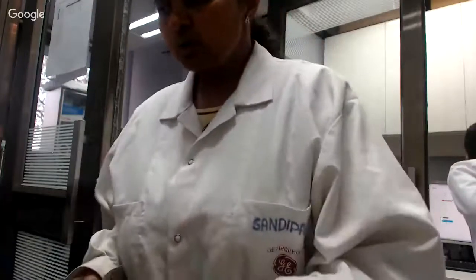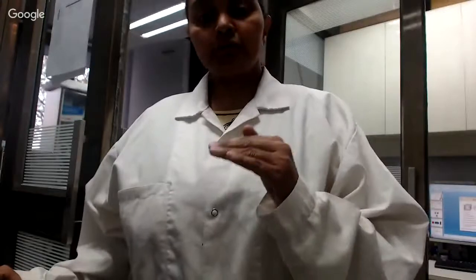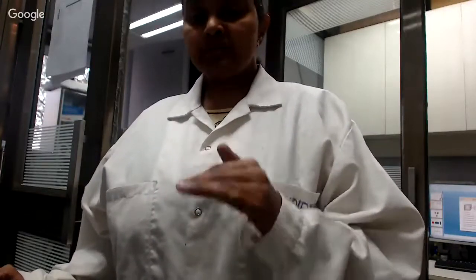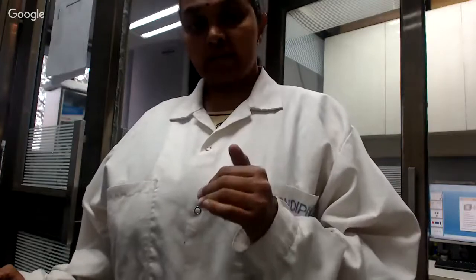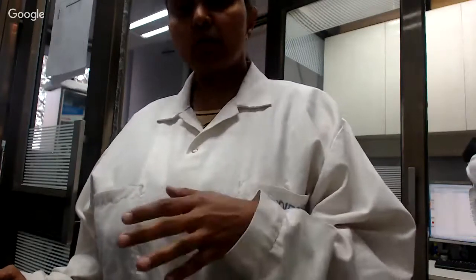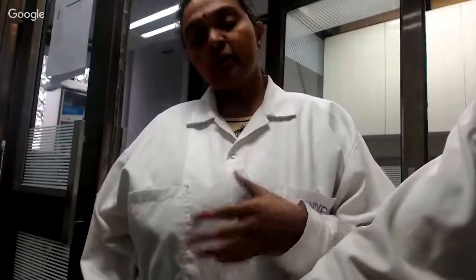There are different ways of loading samples. There is another way which is called the sandwich method, and in this method, a layer of the matrix is first applied to the ground steel plate. Once that dries, the sample is added on top of that, and when the sample spot dries, another layer of matrix is given on top. So depending on the sample, the loading technique and the matrix are decided.